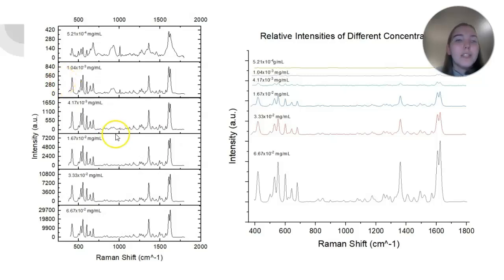If we want to look specifically at peaks in here, if we look at this point on the left, as concentration decreases as we go up the figure, it does get a little bit noisier, especially right at the top. It's hard to distinguish signal from noise up here at low intensities and low concentrations, just because the intensity is not that much bigger than the noise, so that could prove to be an issue, and that's something that probably needs to be worked on.